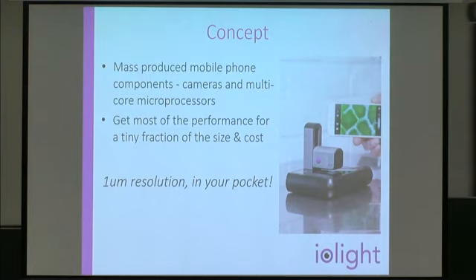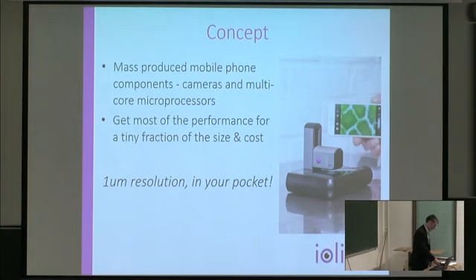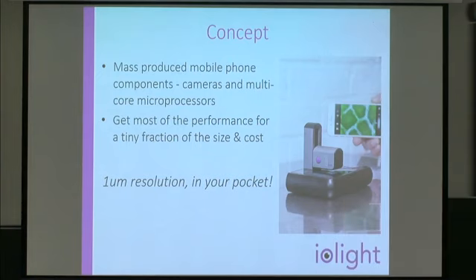So what you end up with is that, a 1 micron resolution microscope, and it fits in your pocket. You take it wherever you like. Pictures appear on the mobile phone, so you can immediately email them, do whatever you like with them. And that opens up a whole pile of different opportunities that don't exist if you instinctively grab the normal technologies that you put in a microscope and do it the same way, because you end up with something that's just too big, too expensive, too difficult to use, and various things like that.